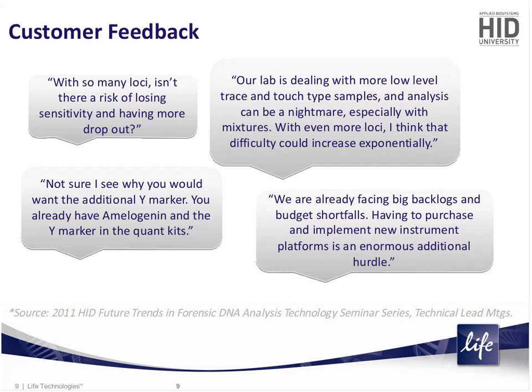Also, labs are often dealing with more low-level trace and touch type samples, and analysis of these can already be difficult, especially with mixtures. And with even more loci, there is the concern that that difficulty could increase exponentially. So not only do we need to think about the overall performance of the system, we also need to try to make it as simple and straightforward to interpret as we can.